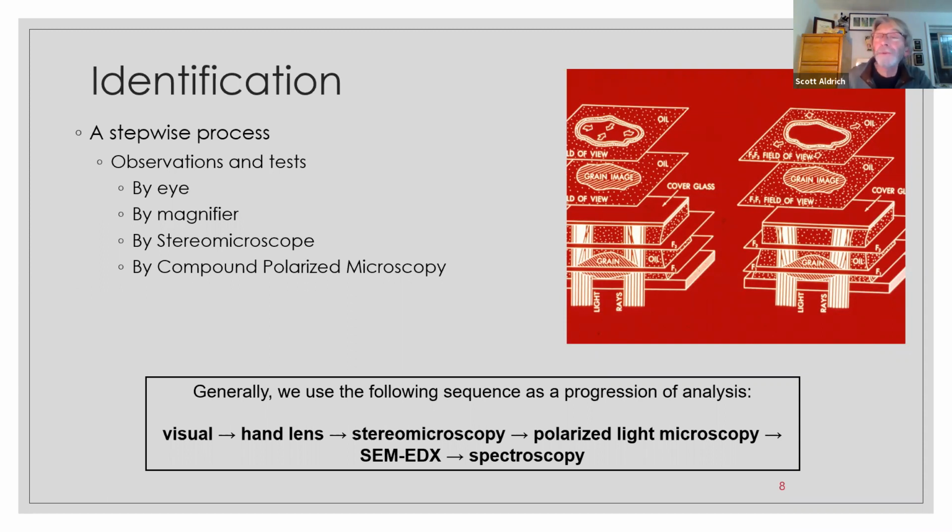They'd always want to use the infrared spectrometer or Raman, or go to electron microscopy. And I'd first say to them, what did it look like visually? What did it look like at 10x? And they didn't know. And the problem with that is every level of magnification tells you something different about the unknown, about the specimen.